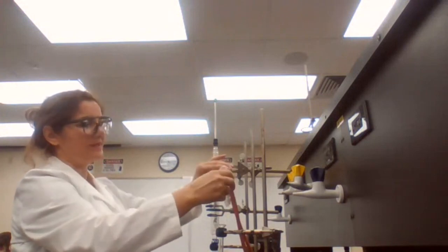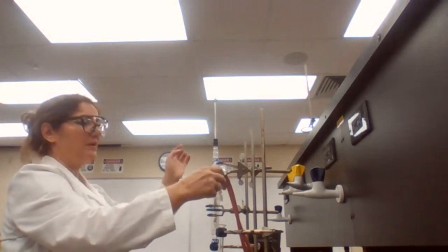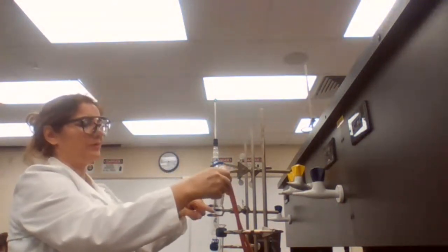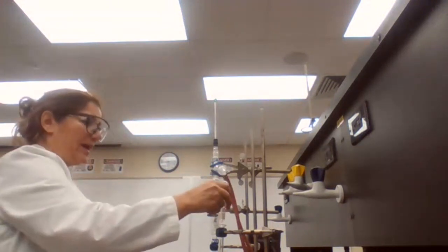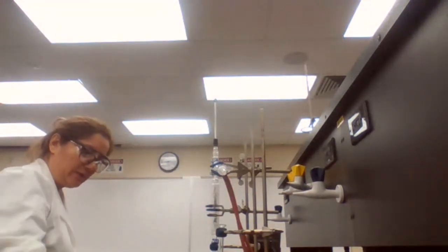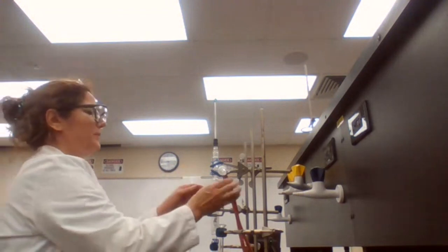Now we have to deassemble it. We disconnect the power first, then water, then we take apart from the cold end to the hot end, one piece of glass at a time, and we put it back where it belongs. We don't want to have them on the bench top.